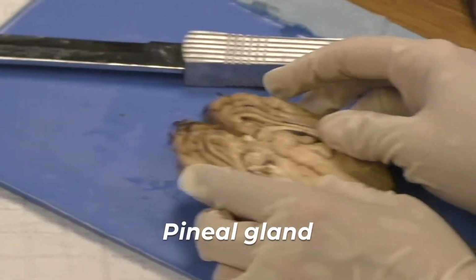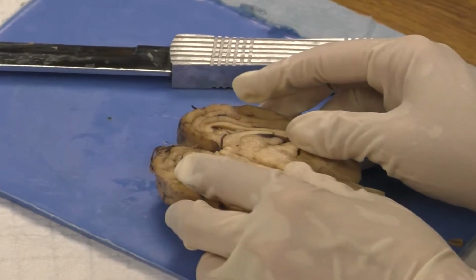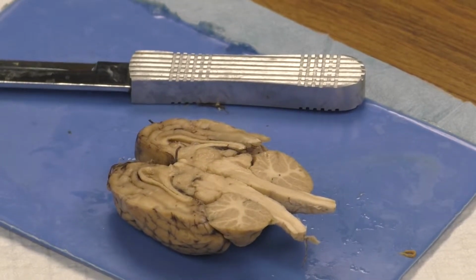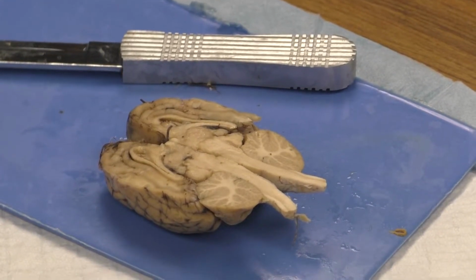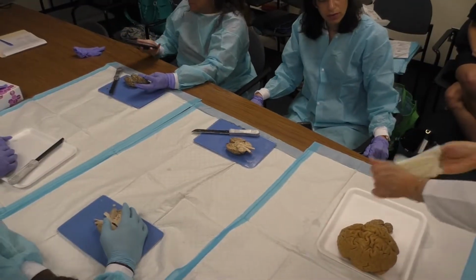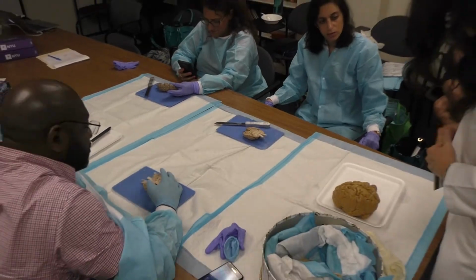So why is the pineal gland interesting? It secretes melatonin. Yes. Involved in our circadian rhythm, sleep-wake cycle. That's more the suprachiasmatic nucleus.